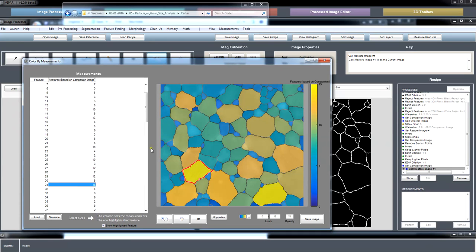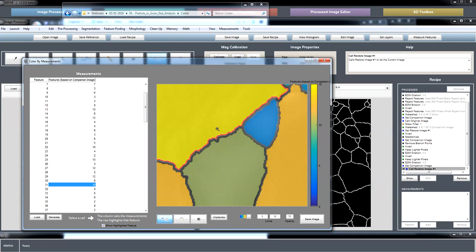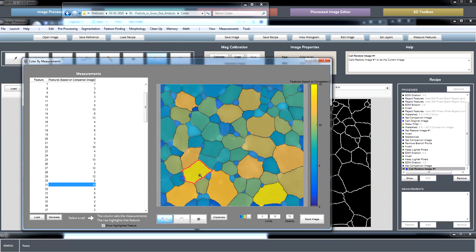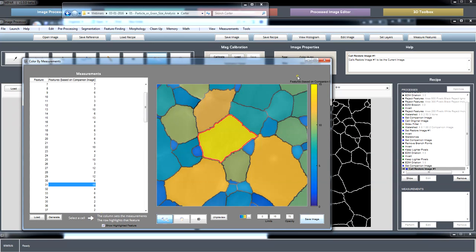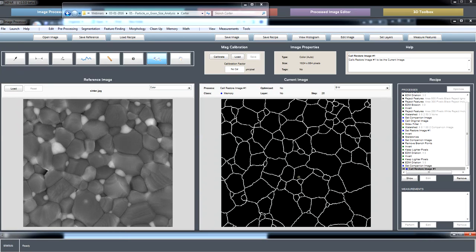Oh, there are some smaller. So what we need to do is possibly adjust, because I don't think 15 is accurate for that. We could be just clipping off bits of those dilated boundaries, and they're being treated as separate features along one grain, even though they're not.